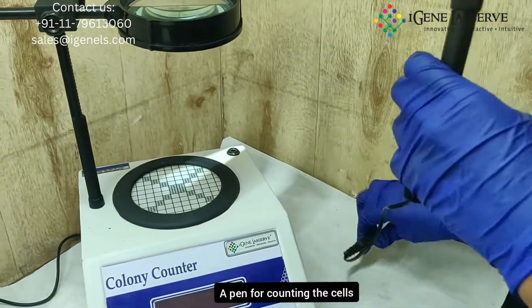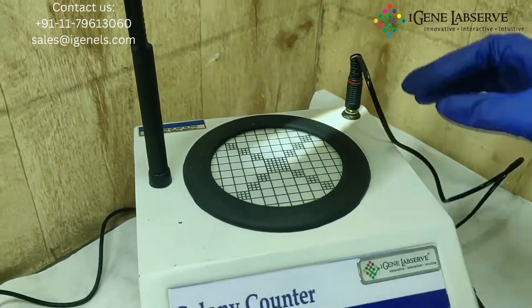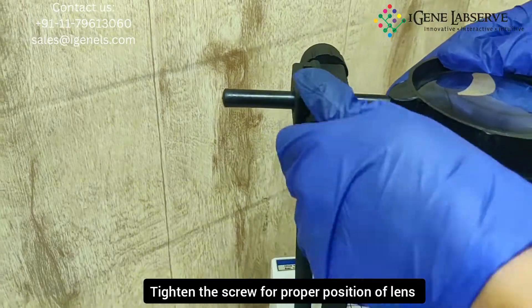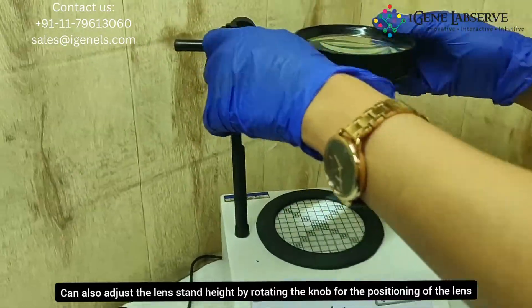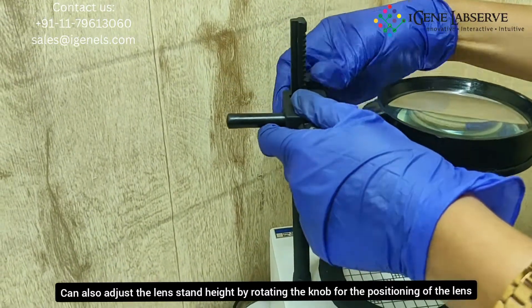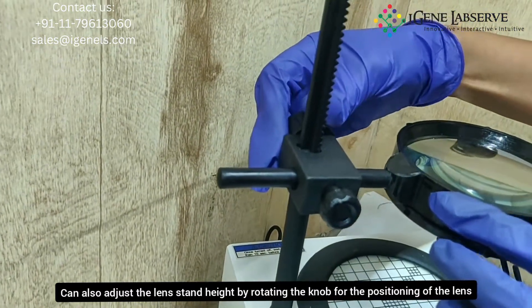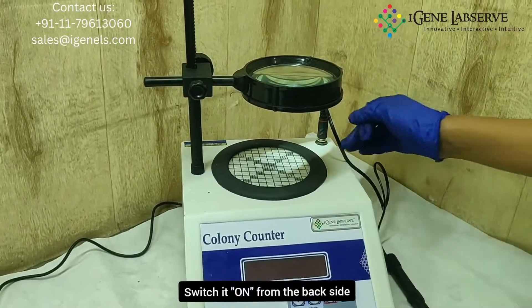It comes with a pen for counting the cells. This here has to be tightened at the proper position. It can also be taken towards the downside — using this particular knob you can adjust it accordingly.